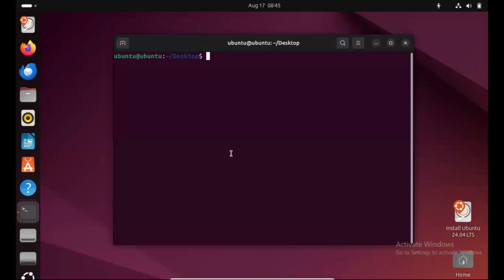I will also show you side by side what happens in the graphical user interface when we apply our commands, so then you will easily understand. The very first command that you want to apply is the ls command. The ls command means list.